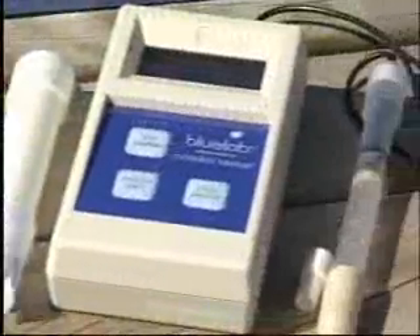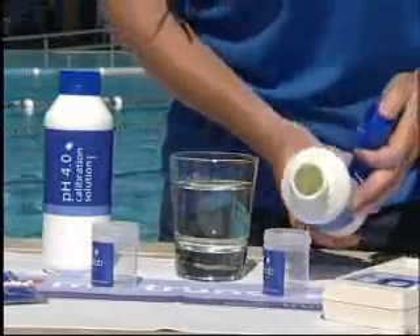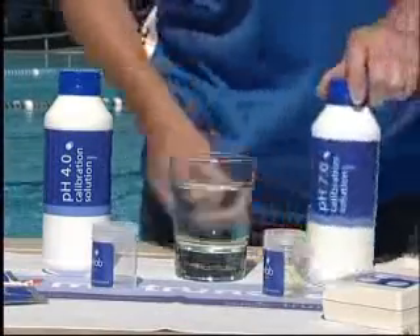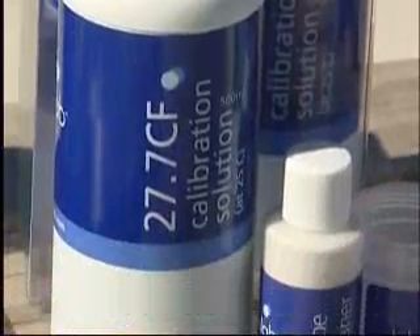Although the conductivity probe does not require calibration, both it and the pH probe require regular cleaning. The pH probe should be cleaned before the meter is calibrated. The Bluelab conductivity and pH cleaning kits have all the essentials for cleaning and maintaining the Bluelab combo meter.